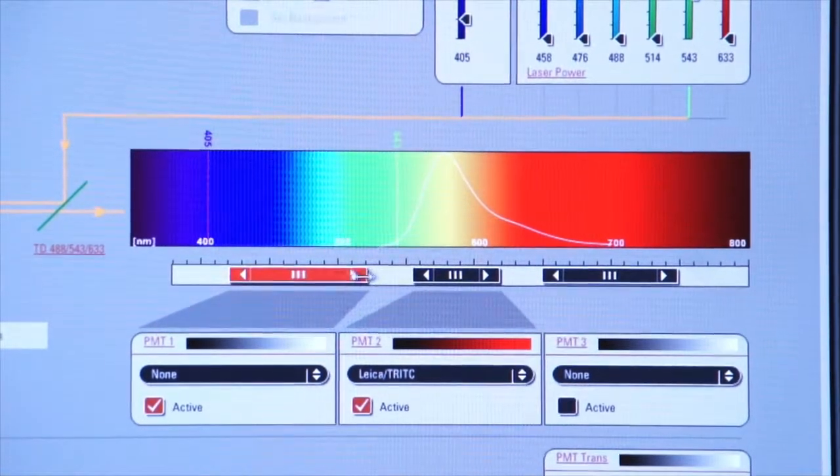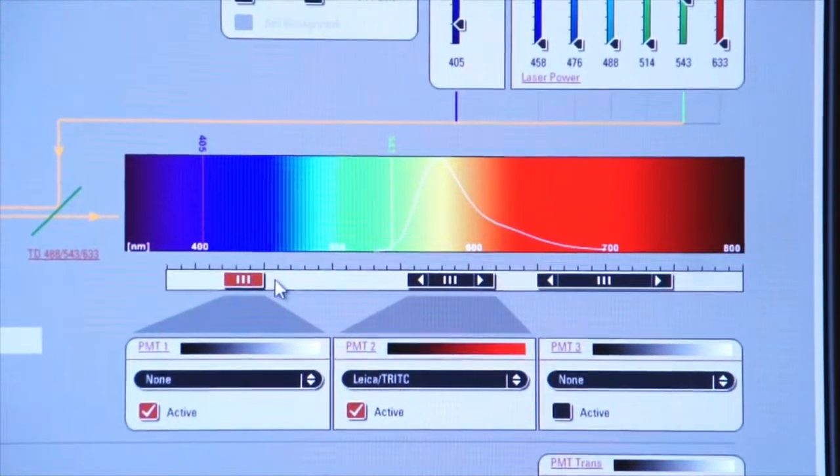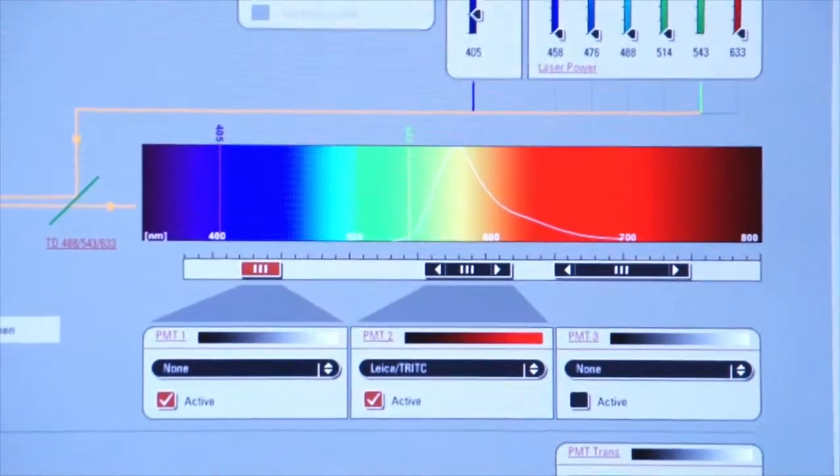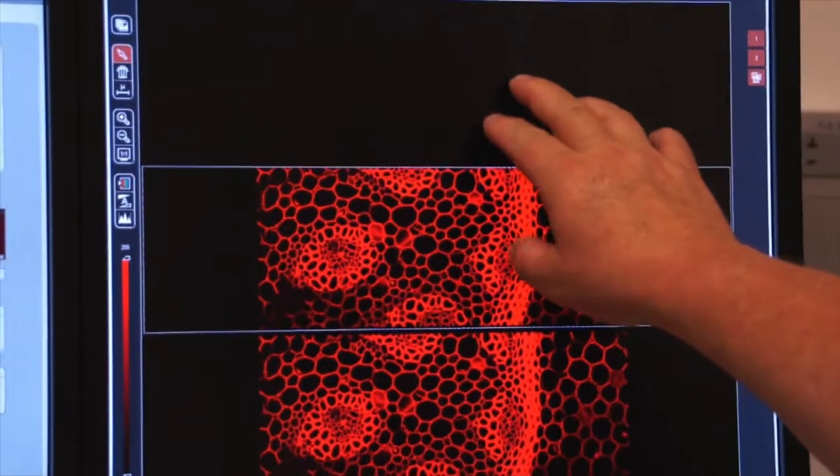I can narrow this PMT or I can lengthen it. Let's leave it narrow for a second. We'll click on live and look over here—you can see not a lot of information on my top window.